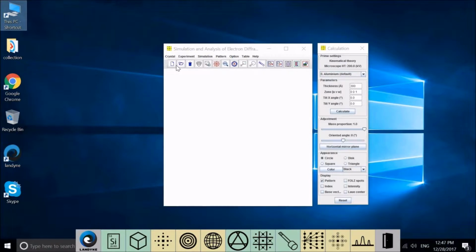The graphic menu bar here is part of the drop-down menu, but it is the most often used one, at least here, except for the drop box. It only appears in the graphic menu here.